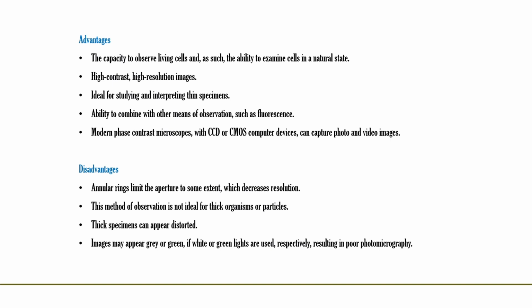Disadvantages: annular rings limit the aperture to some extent, which decreases resolution. This method of observation is not ideal for thick organisms or particles. Thick specimens can appear distorted. Images may appear gray or green if white or green lights are used, respectively, resulting in poor photomicrography.